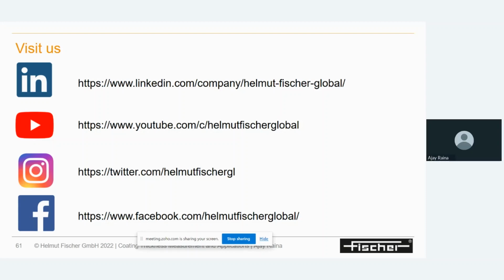If your first layer is too thick, say your first layer is silver and you have done more than 70-80 microns, then I will not say it will go to the second layer. But if your coating is approximately 1, 4, 5, or 10 to 15 microns, then yeah, we can go about 5 layers, 6 layers, 10 layers. It all depends on the densities of the material, which coating you have done and how much coating thickness you have done.